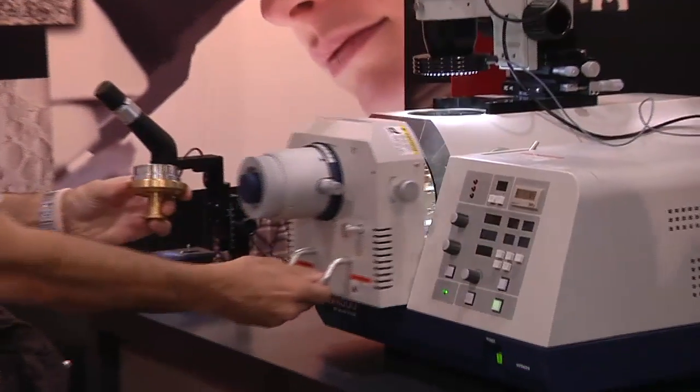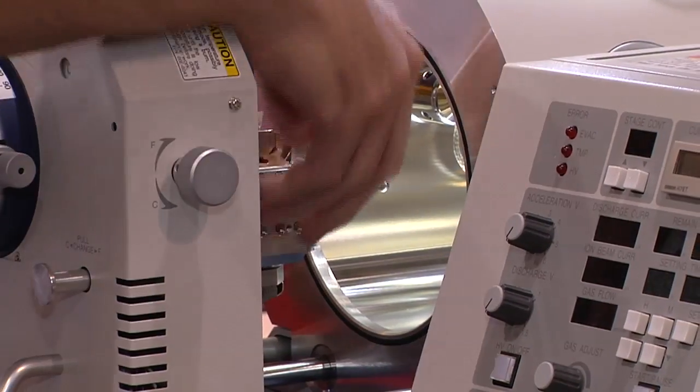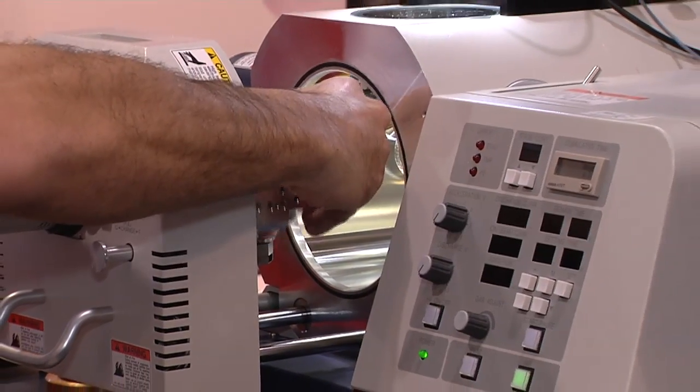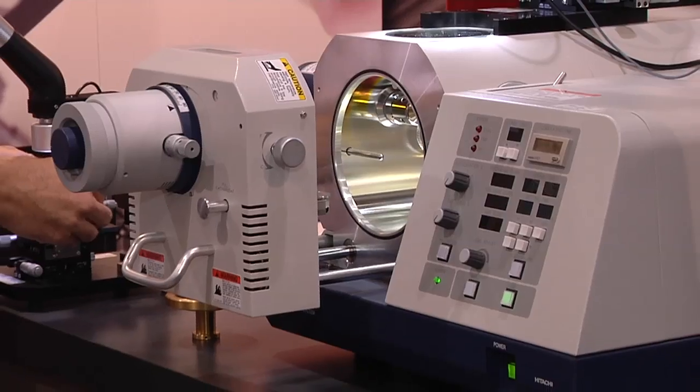We can quickly load that into our Hitachi IM4000. When it comes to flat milling, there are several different tilting angles that we can produce, whether or not you want to prepare a very smooth, fine and flat surface, or a relief effect.